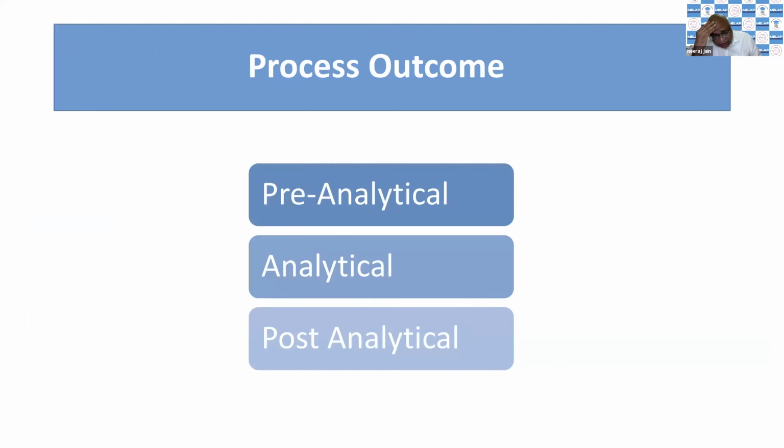With this, we have checked our process variation related to different analytes, but also we have to see process outcome, labeling errors, or in histopathology, quantity of the formalin is not adequate with the specimen, or clinical history is not available. Anything we can select, we have to see defects per million opportunity.